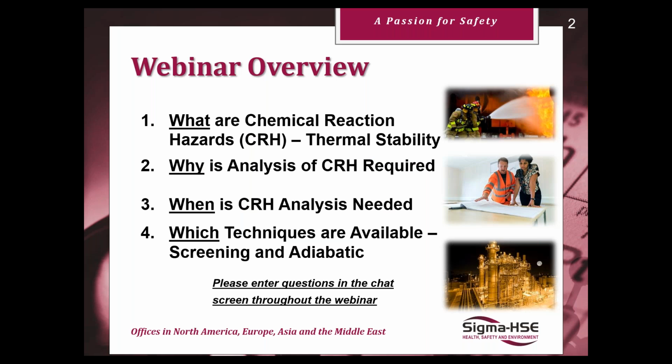The start of this webinar, just a bit of an overview. We've got 4 questions which should help us set out what exactly thermal stability issues are in regards to chemical reaction hazards, why the analysis of these hazards is required, and the relevance to your process, when chemical reaction hazards analysis is needed or recommended, and also which techniques are available to help you assess your process during scale up and redesign.